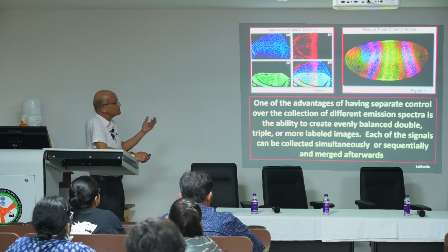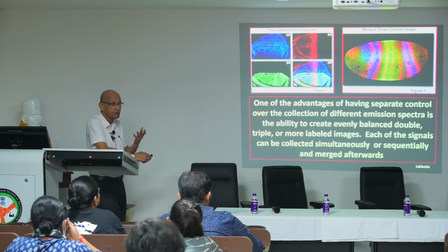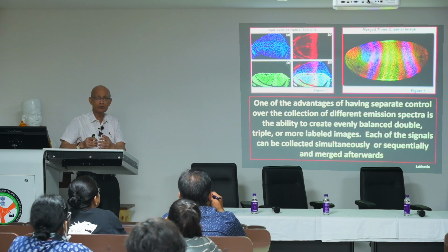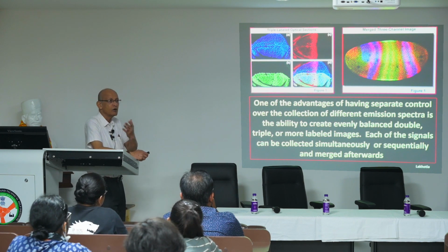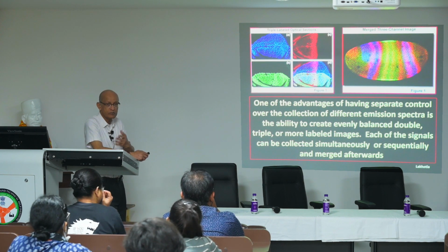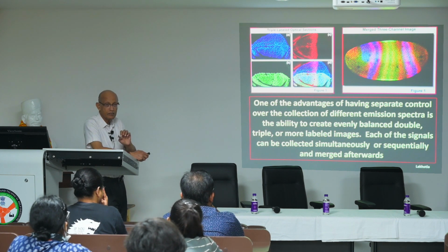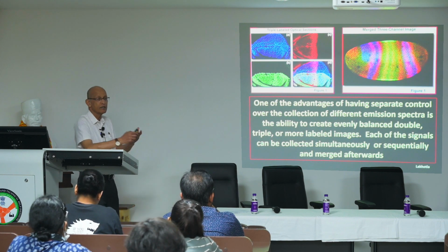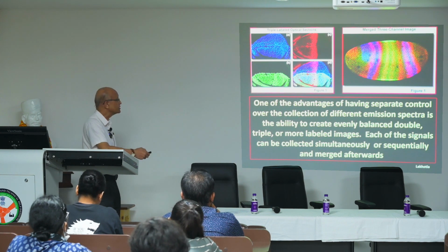And these kinds of images have been really instructive in letting us know what happens in development, how cells get to know their fate, but also in any tissue, which cells are expressing which kind of protein or which kind of RNA. We can use techniques like in situ hybridization to detect RNA, or immunostaining to detect proteins. And so one can combine RNA and protein together, or RNA and DNA, or protein and DNA, or some other molecule like lipids, as long as you have fluorochromes or antibodies that will identify a given class of molecule. They can be combined together.